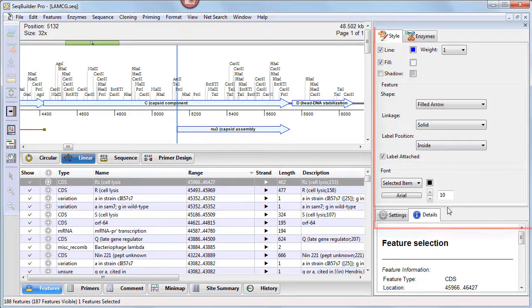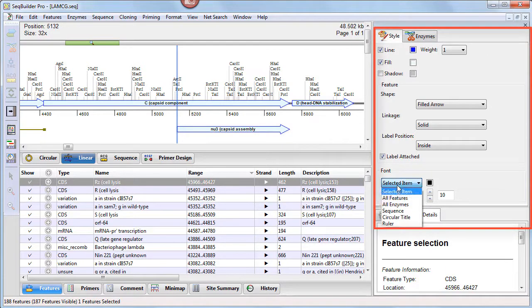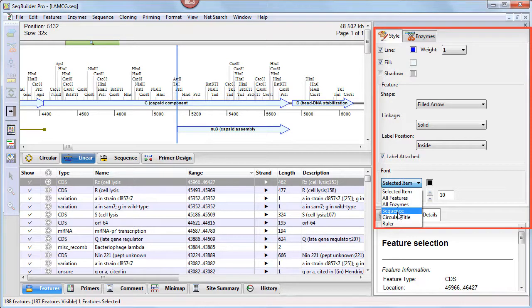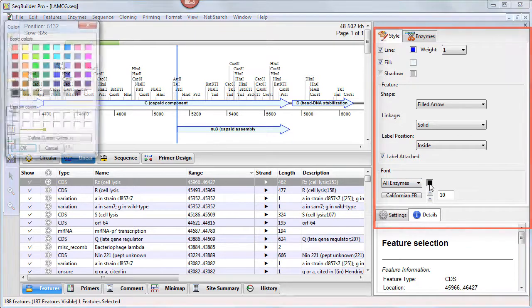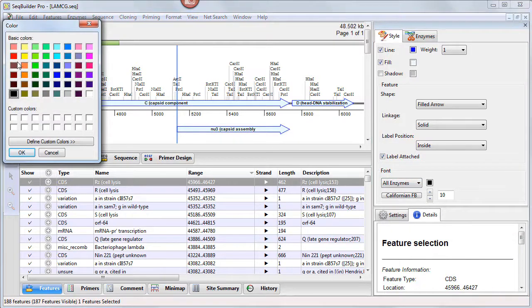In the Style panel, SeqBuilder Pro now lets you select all items of a certain type, such as all enzymes, all features, or the entire sequence, and change the style in which they're displayed.